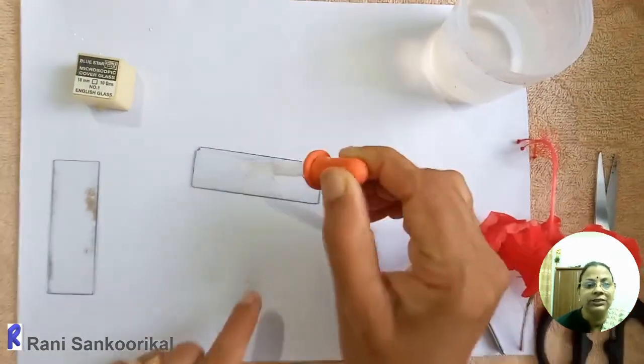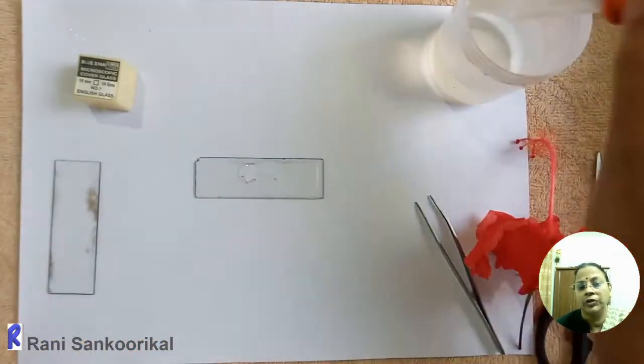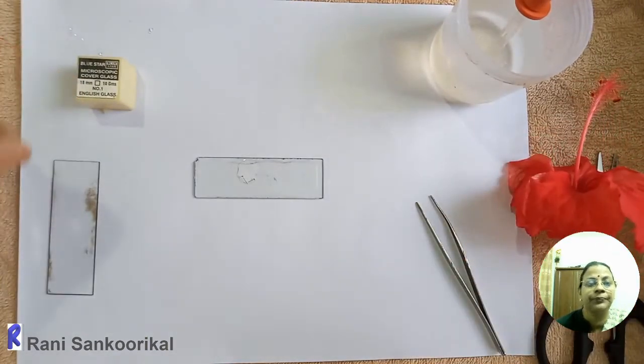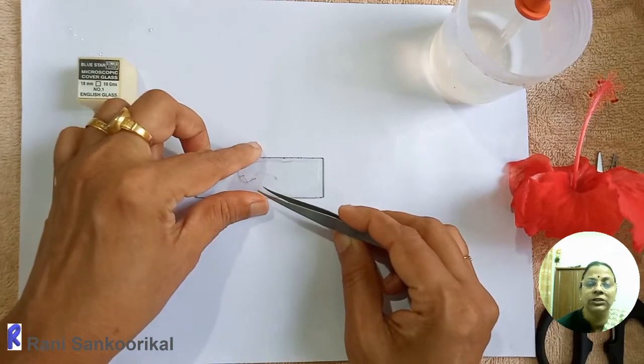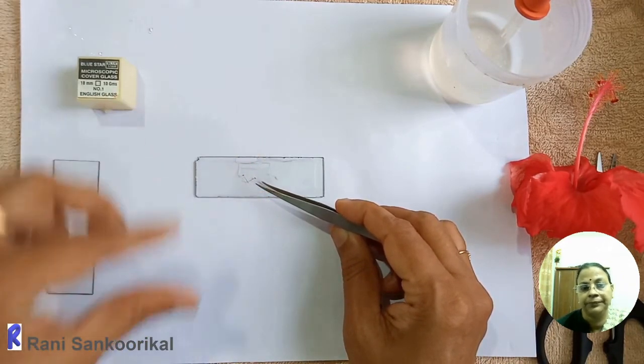So you can press it gently on the anther and pour 1 drop of sugar solution, which we have already prepared. Then take the cover slip with the help of needle or forceps. We can place it on top of the pollen grain.